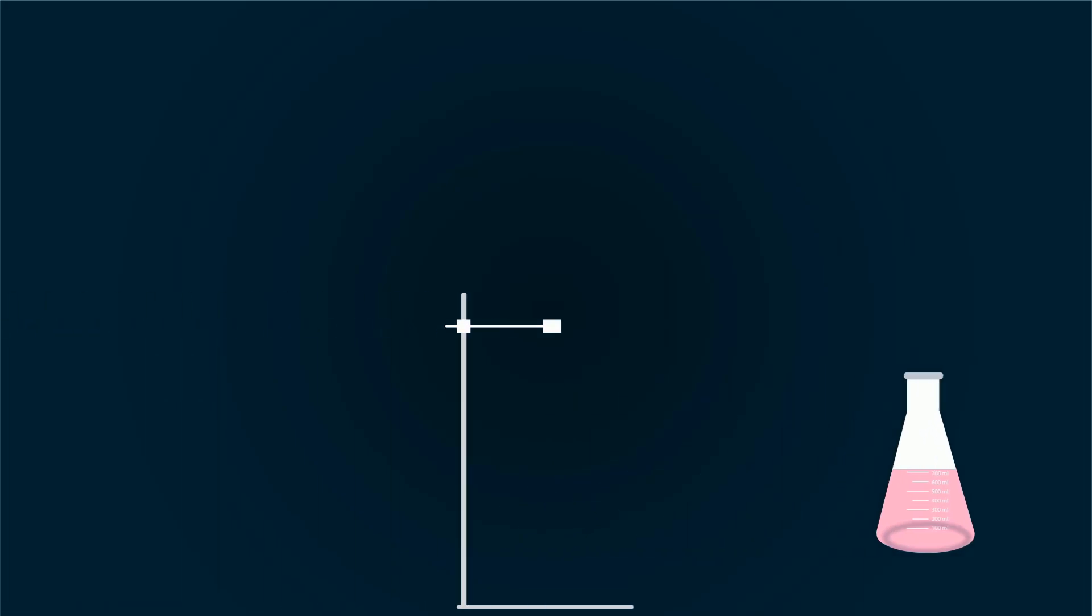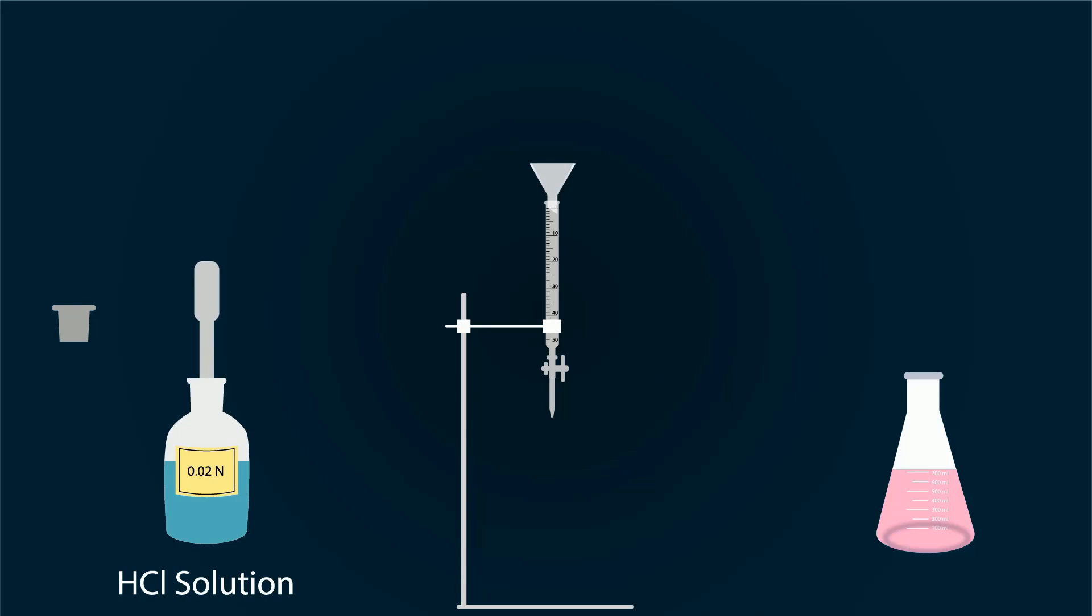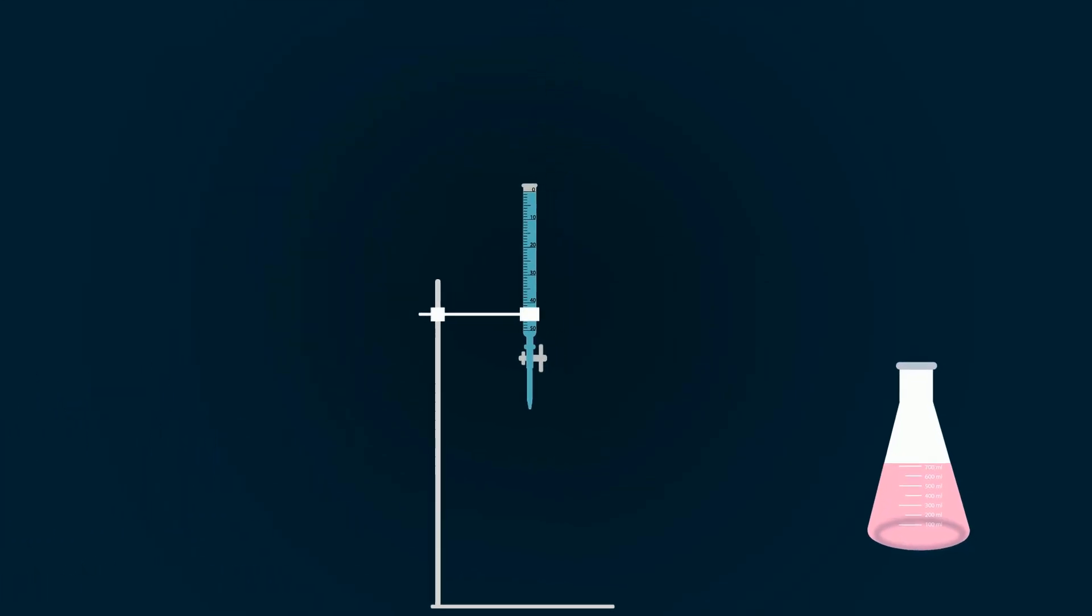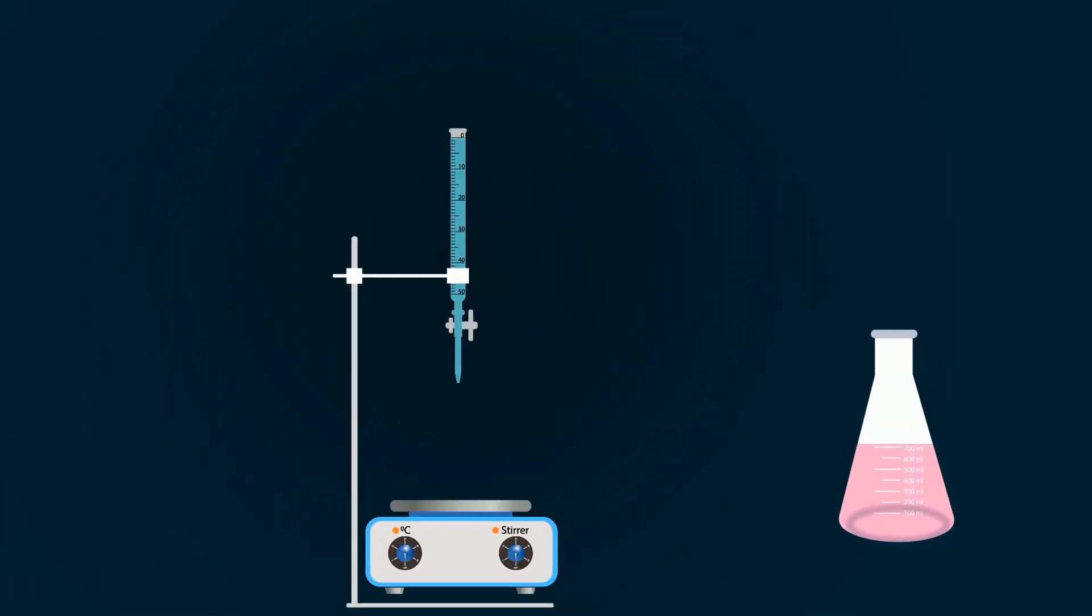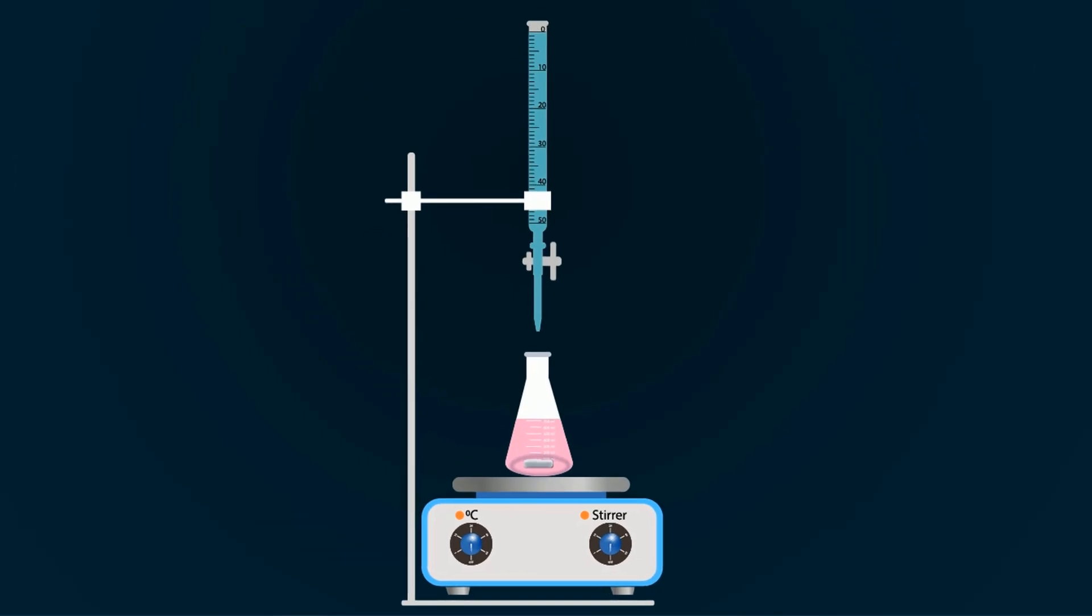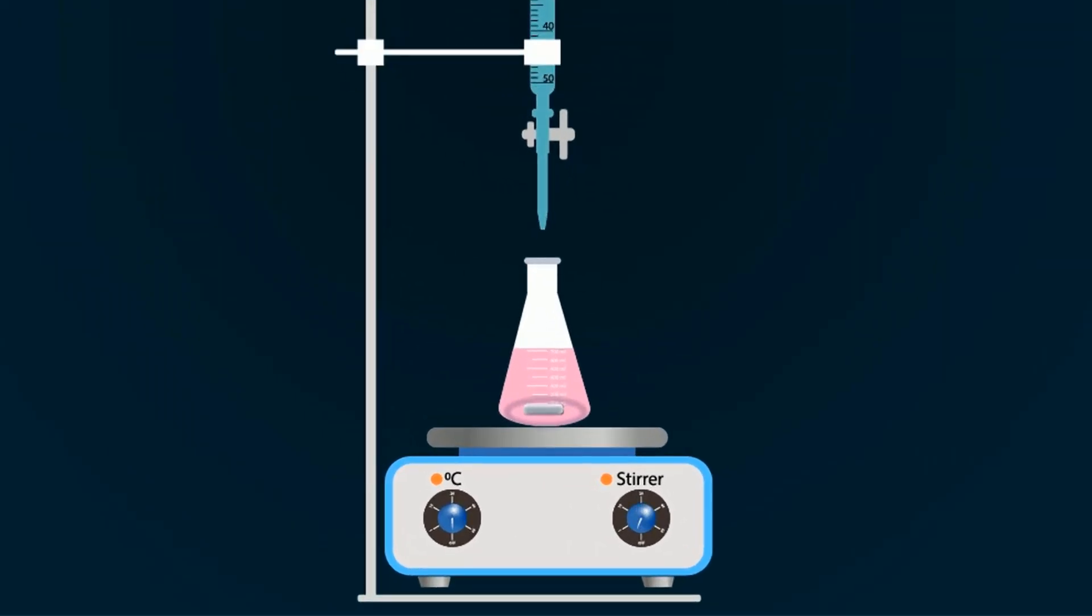For titration, take a stand and add burette on it and don't forget to put funnel. Fill the burette with 0.02 normal HCl solution up to the zero point. Adjust the magnetic stirrer under the burette and add magnetic bar into the conical flask. Put the conical flask on the magnetic stirrer and turn it on for homogenous mixing.